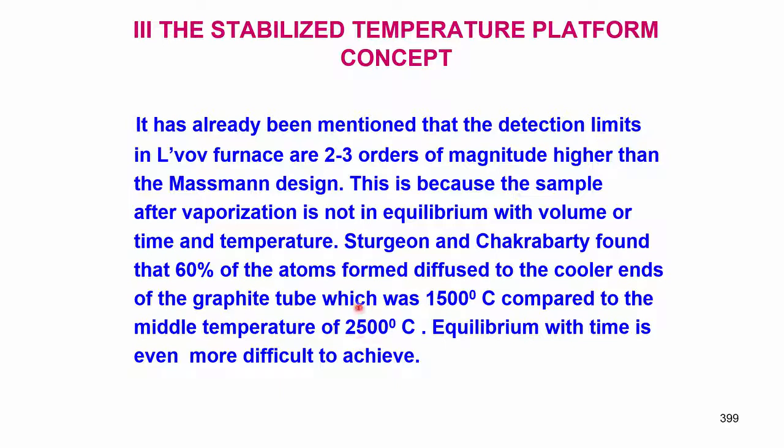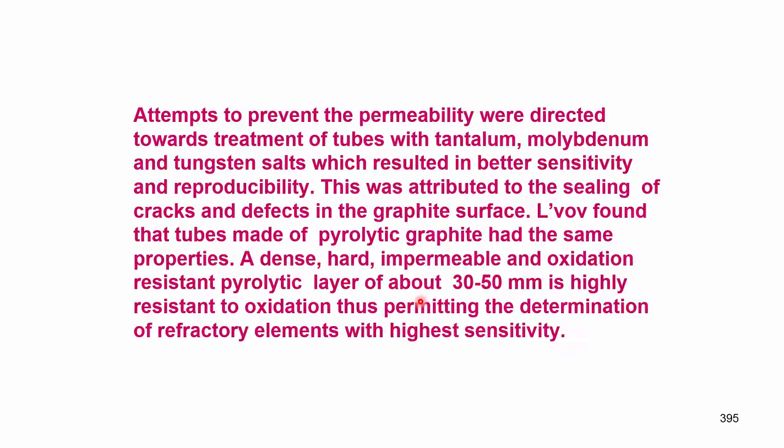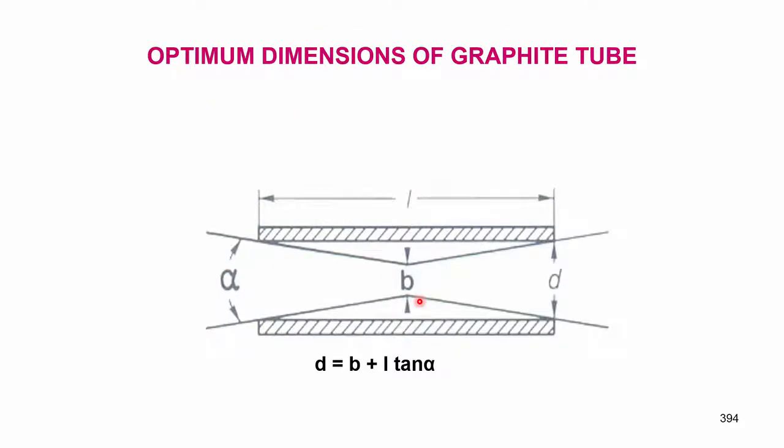If you go to the Massmann design, yes, this is the Massmann design. If it is 2500 degrees in the middle, it will be 1500 near the edges.